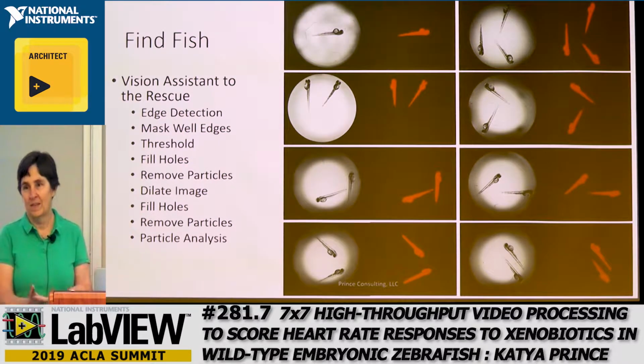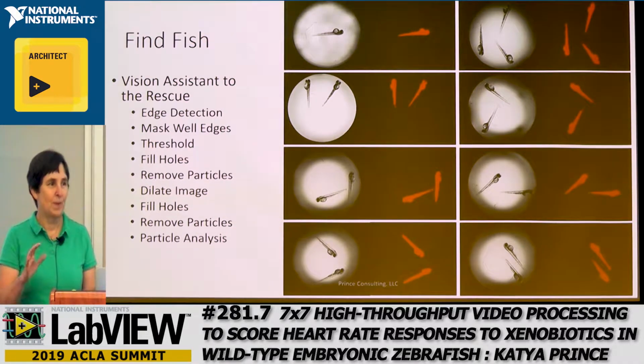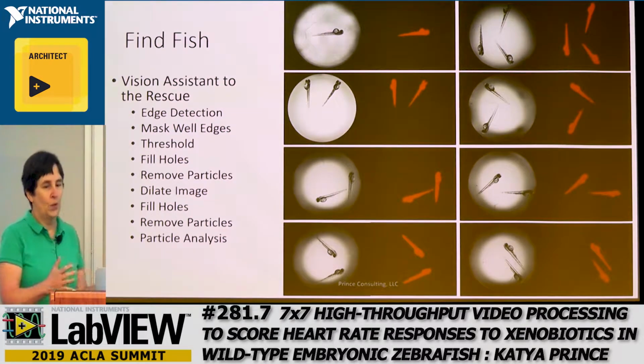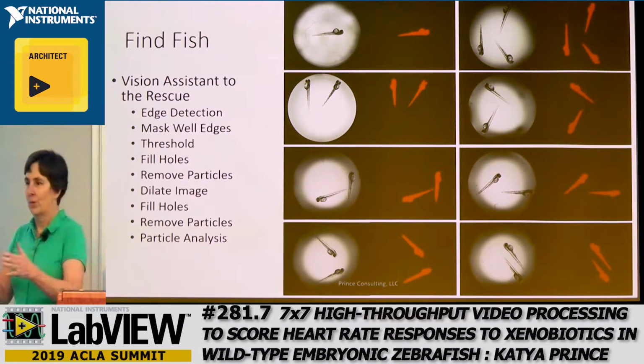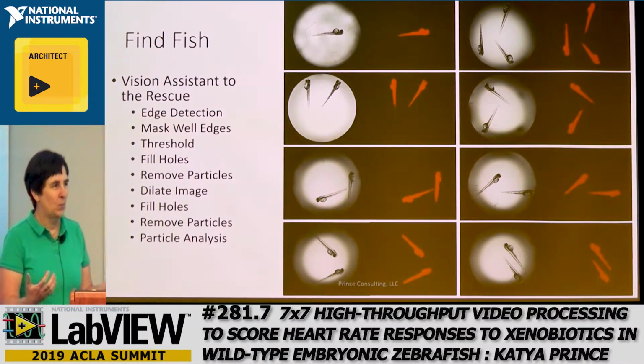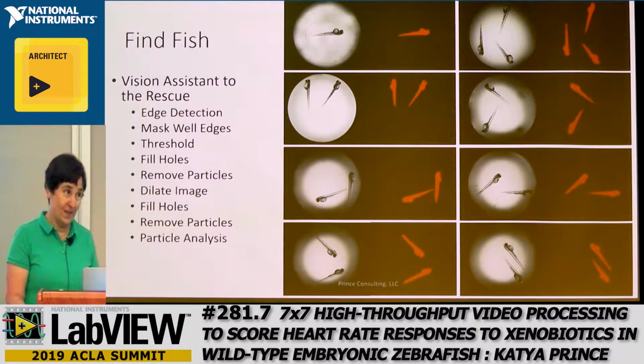The biggest problem next is going to be how to find the heart. And I thought about trying to do some sort of pattern matching, but you can sort of see that these things have all sorts of different orientations, top and bottom. But the bigger issue is that they can also roll. So I may be looking at it front on or to the left or the right or whatever. So we had to come up with a geometric way of trying to find the region of interest. And that's where the high school geometry comes into play.